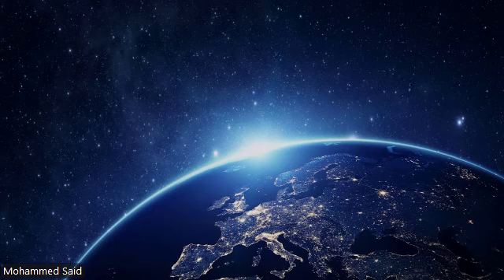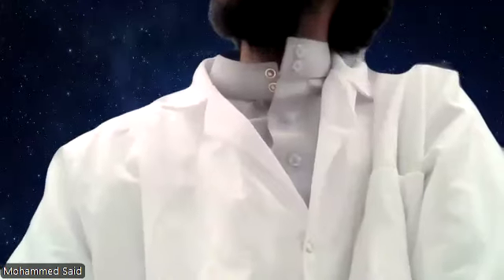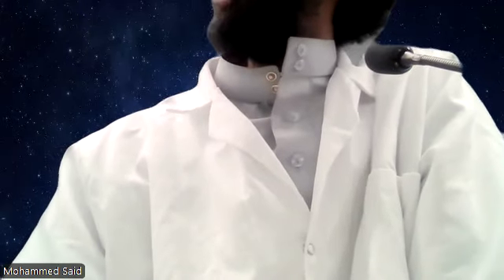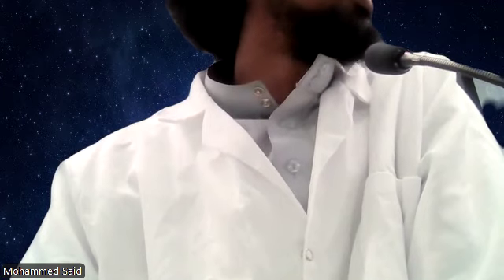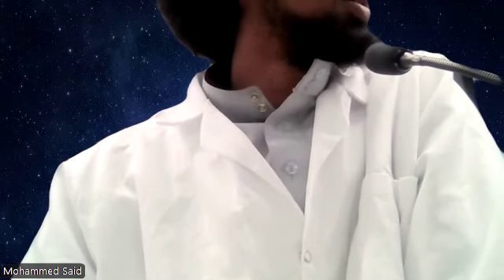Okay, let me just answer some questions. Update from everyone. How's it going for exercise 1? Are we done the first spin? Yes or no? We're into the first spin. Okay. Are you also done? Okay, that's okay. For the incubation, yes. And by the way, that will be done at room temperature, not at 37 degrees. So please do not place them into the incubator.